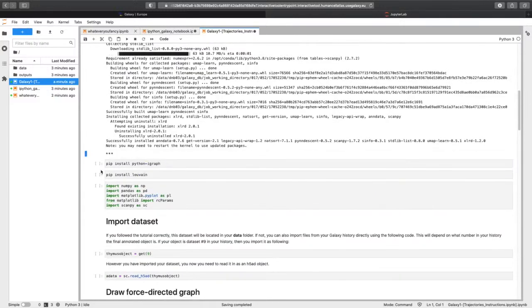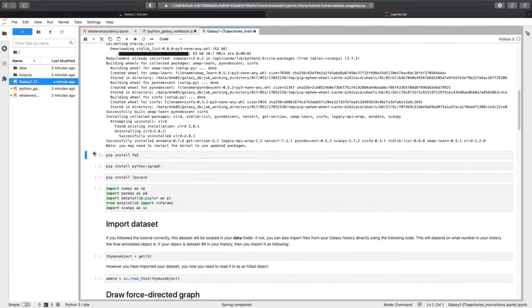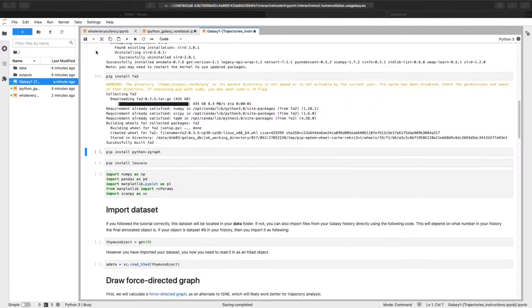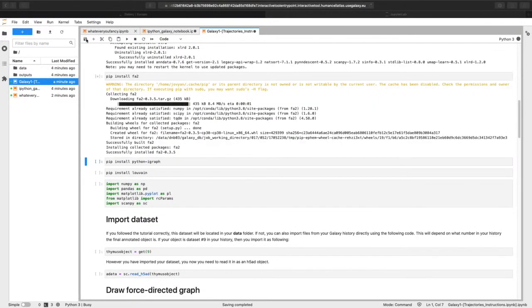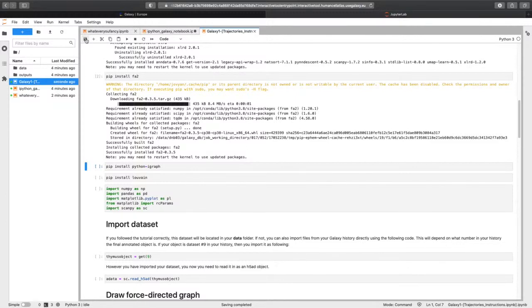All right, and it always says you may need to restart the kernel. Don't, don't wig out about that. And I'm going to save how I'm doing. Okay, that is not hugely useful.